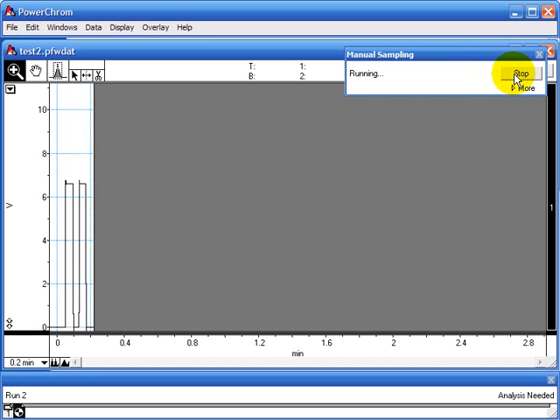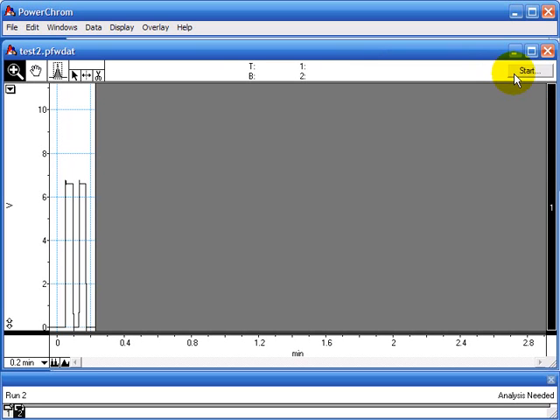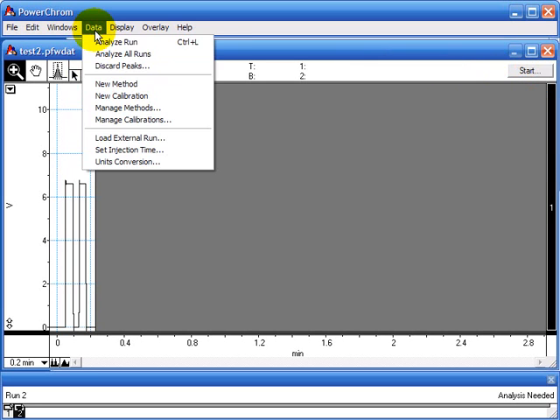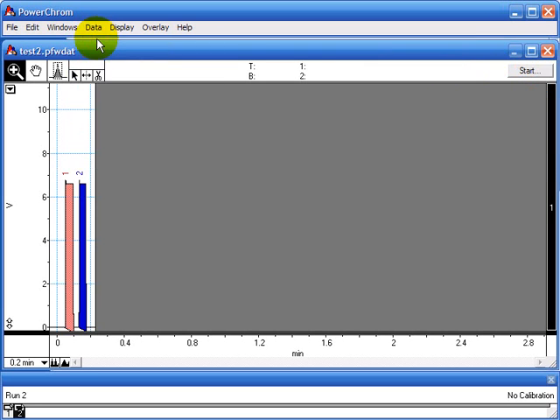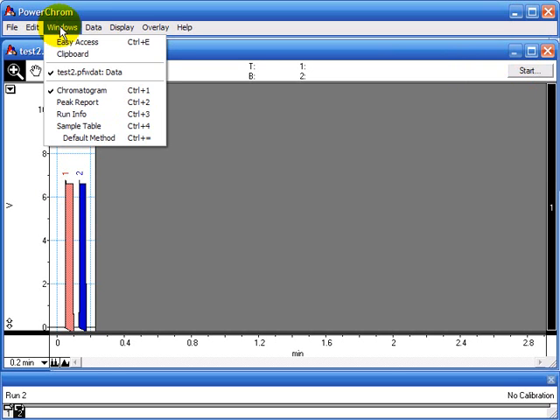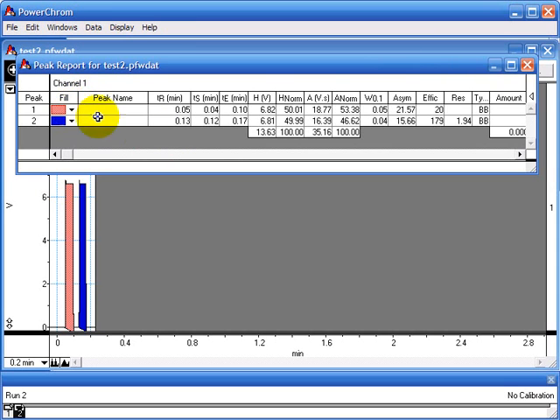When you're finished, you click stop. Data, analyze run. We integrate those 2 peaks. And the peak report now shows those 2 peaks.